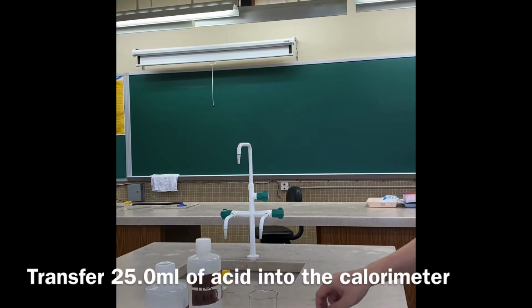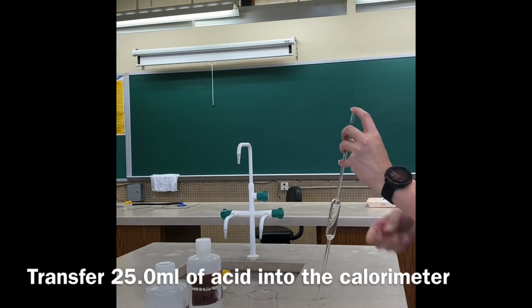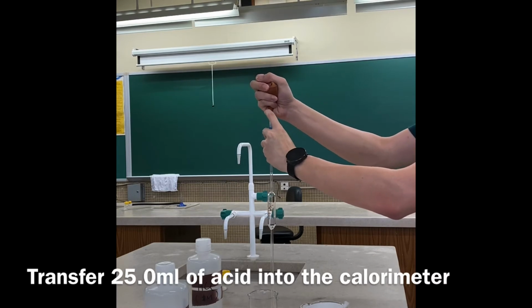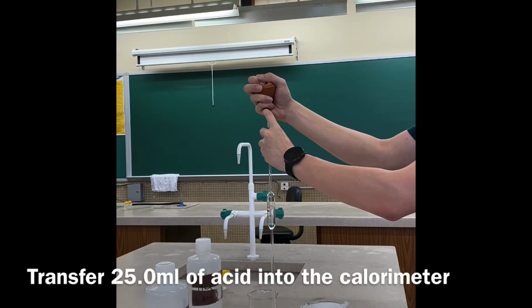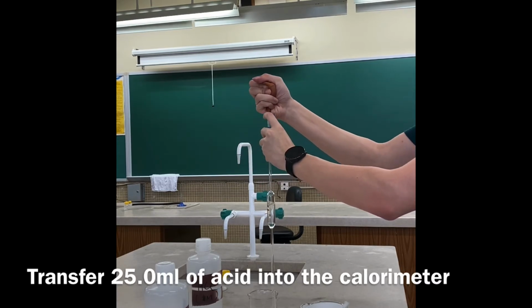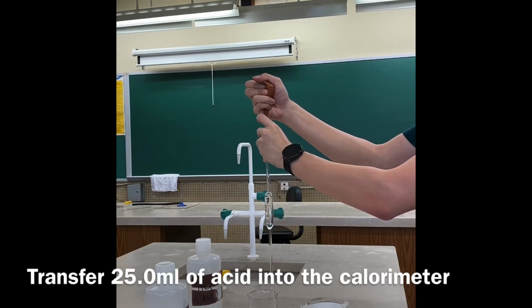Then you have to transfer 25 ml of the acid solution into this beaker. Can you tell me the reason why we have to use a pipette? The use of a pipette is to transfer an exact, accurate amount of a fixed solution, for example in this one, 25 ml. And you know the molarity of the acid is 1 M, so when you multiply the molarity by the volume in liters, you immediately have the number of moles.